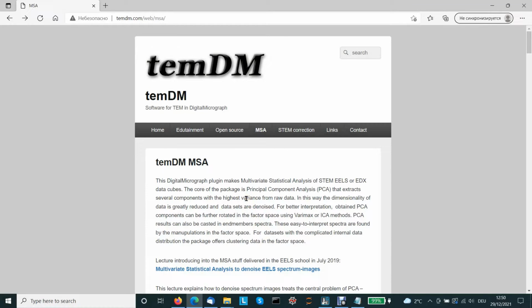Hello. Today I want to convince you that temDM MSA package is the best package for multivariate statistical analysis. You know, nowadays there are a lot of software for statistical treatment, but I will clearly demonstrate to you that temDM MSA is superior. Well, speaking seriously, each software has its own advantages and disadvantages. What I'm going to do is just to highlight a few very specific features of temDM MSA.